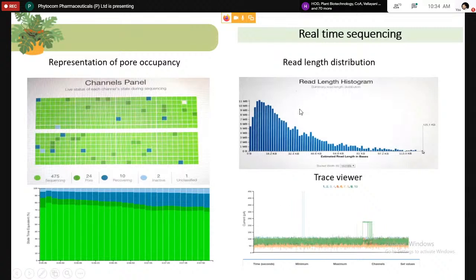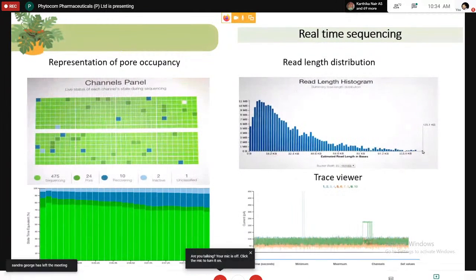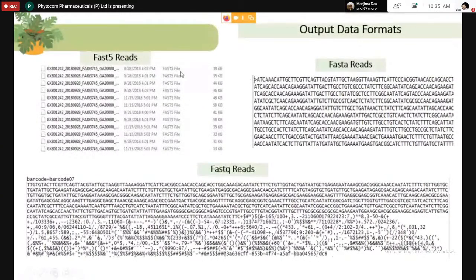In real time, you can even see the largest fragment sequenced. I once obtained a 21 MB sequence. This is the result you get after sequencing. While the DNA goes through the nanopores, the files are stored in a FAST5 file format, and this file format is used for base calling. After base calling, we get the FASTQ reads.